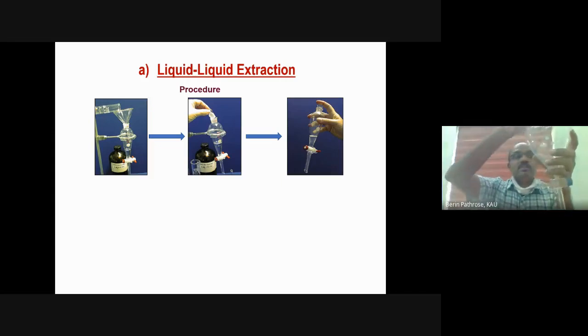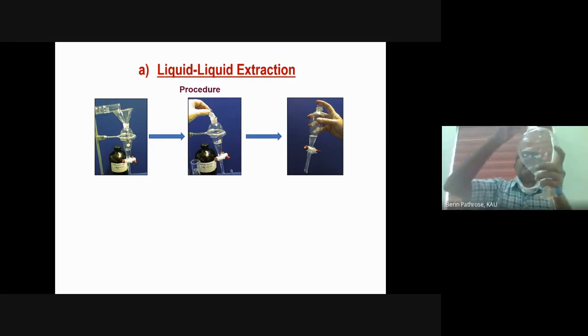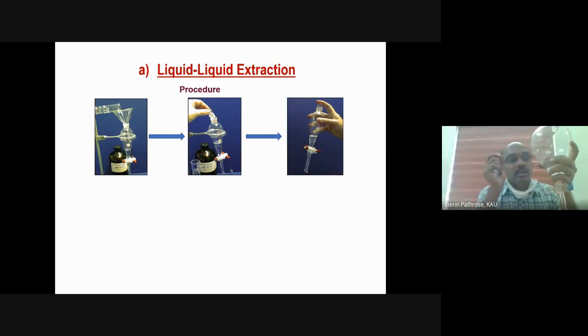So what we will do is add a bit of water into it, then add solvent and close it.